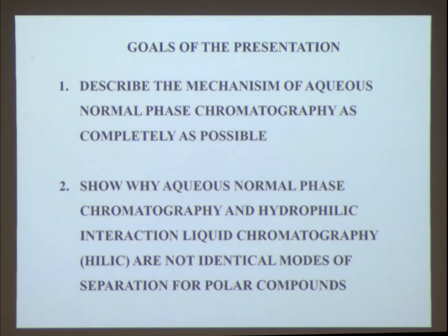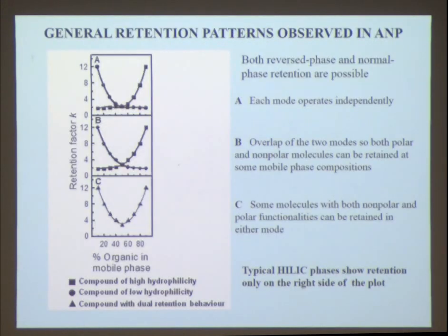It's great to look at something from a theoretical point of view, which I'll try to describe here as well, but it's also good to prove to you why it's useful. Hope I'll accomplish that. So here we go, a little bit about aqueous normal phase chromatography.